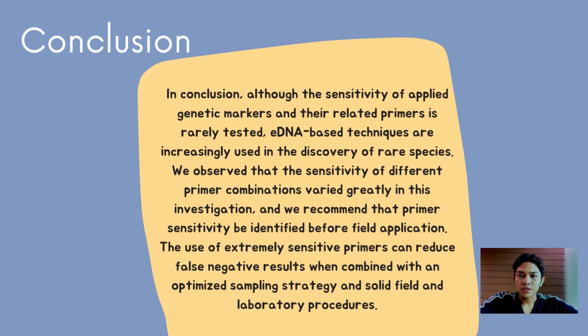In conclusion, although the sensitivity of applied genetic markers and their related primers is rarely tested, eDNA-based techniques are increasingly used in the discovery of rare species. We observed that the sensitivity of different primer combinations varied greatly in this investigation, and we recommend that primer sensitivity be identified before field application.